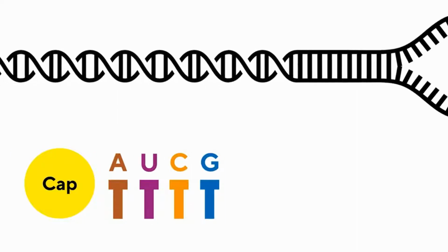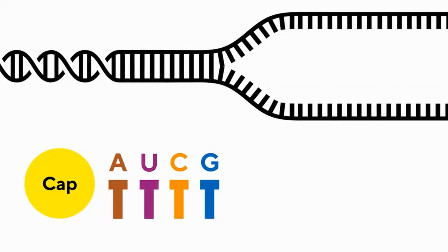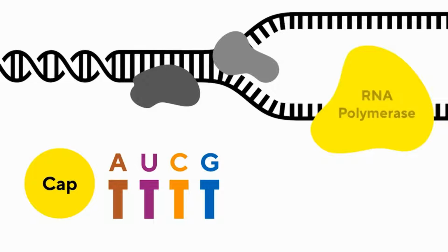The IVT reaction is relatively complex, involving many different components. The most important among them are capping reagent, nucleotides, pDNA template from which the mRNA will be transcribed, various enzymes, with RNA polymerase being the most crucial one, and magnesium ions, which we have found to be very important in the IVT reaction. Under the right conditions, mRNA production continues until the nucleotides are consumed.